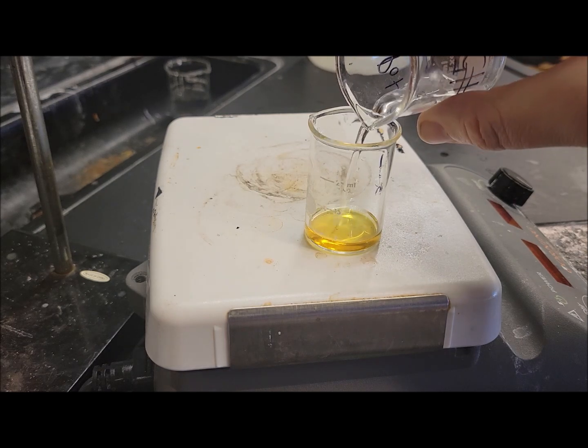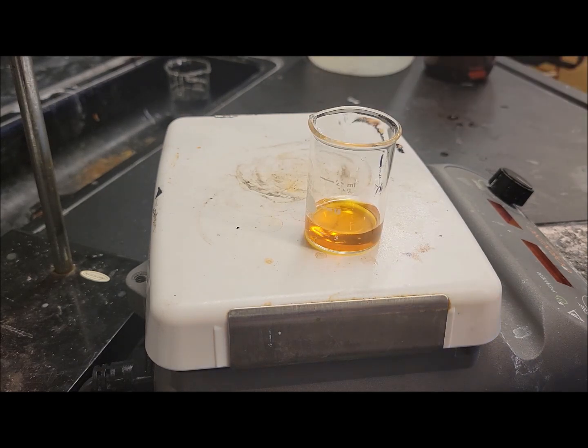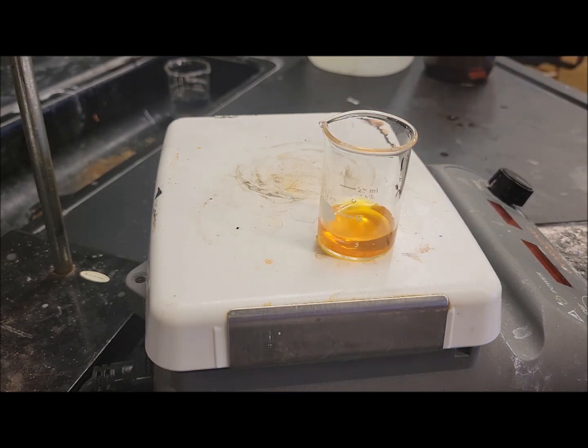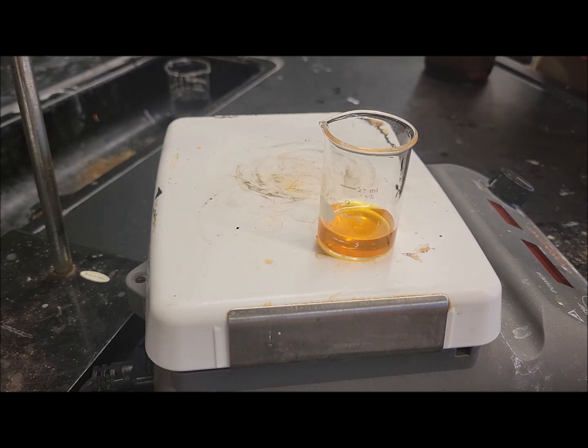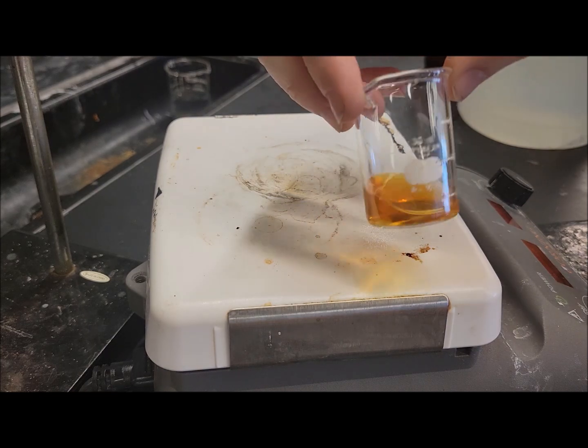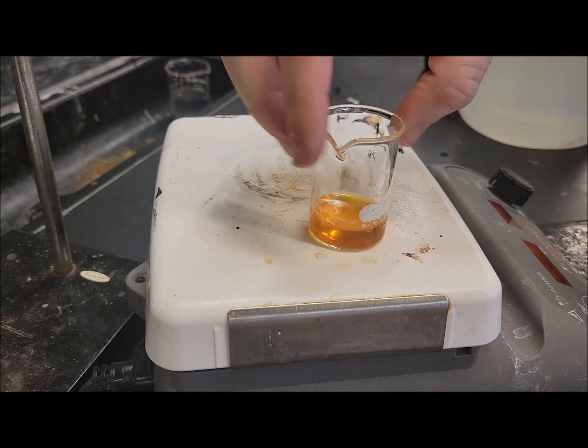Oh. And it has resumed its original brown color. I'm sure adding more bleach would further oxidize this. See, now I don't think I need to add any vinegar. Doesn't appear to be very lumpy.